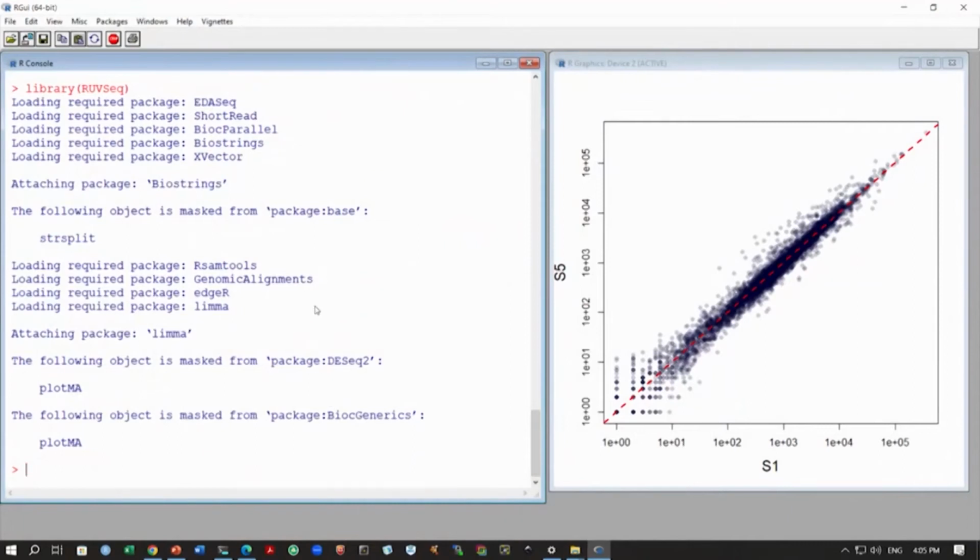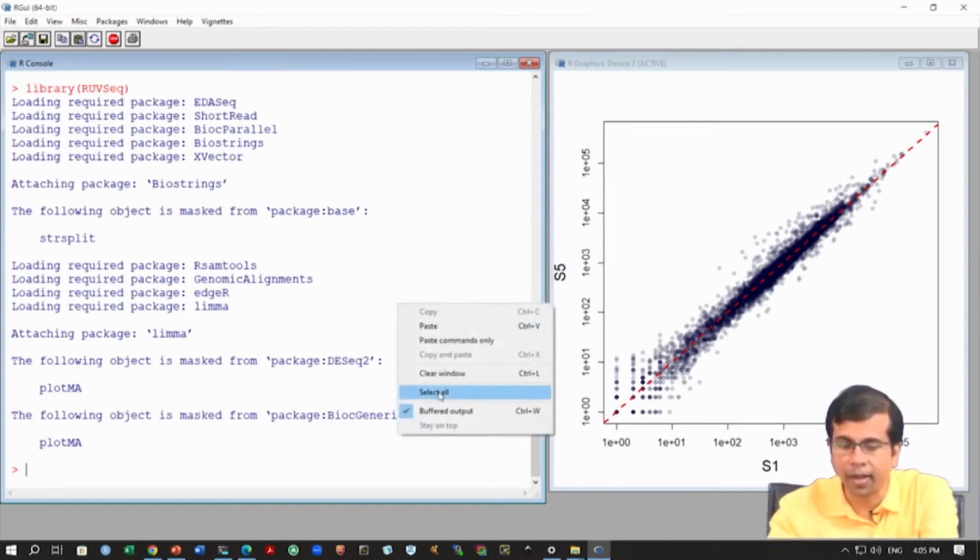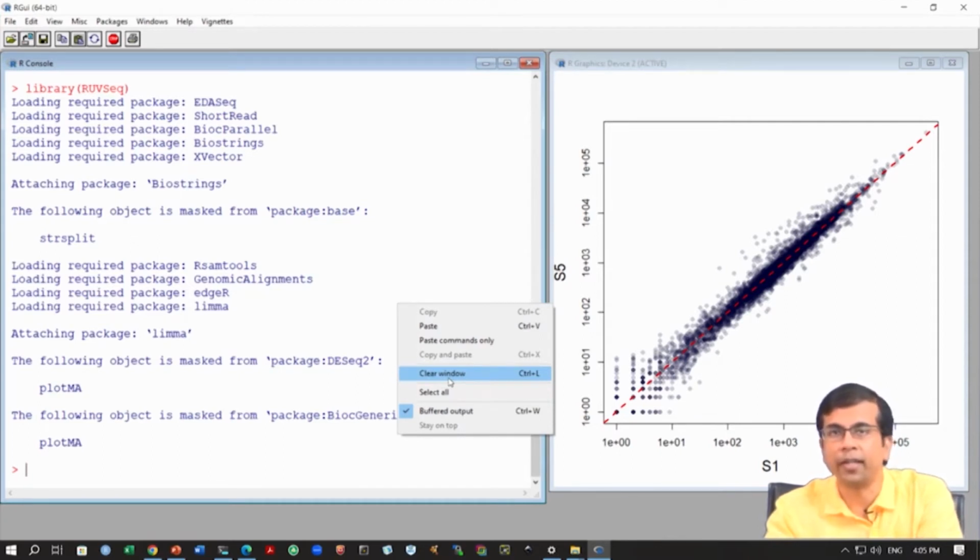We move on to R here, and we have the data. To do this, we need a lot of packages, and there is a pipeline that we will have to follow. I have collected all the code and developed the scripts, and I will show you how this works. I will also mention the packages that we are going to use. The question you might have is how you find this out. This is actually well known. If you are working with these packages for a long time, you know which package can do what, and of course, you can learn. You can go through these packages when new packages come out or are published.